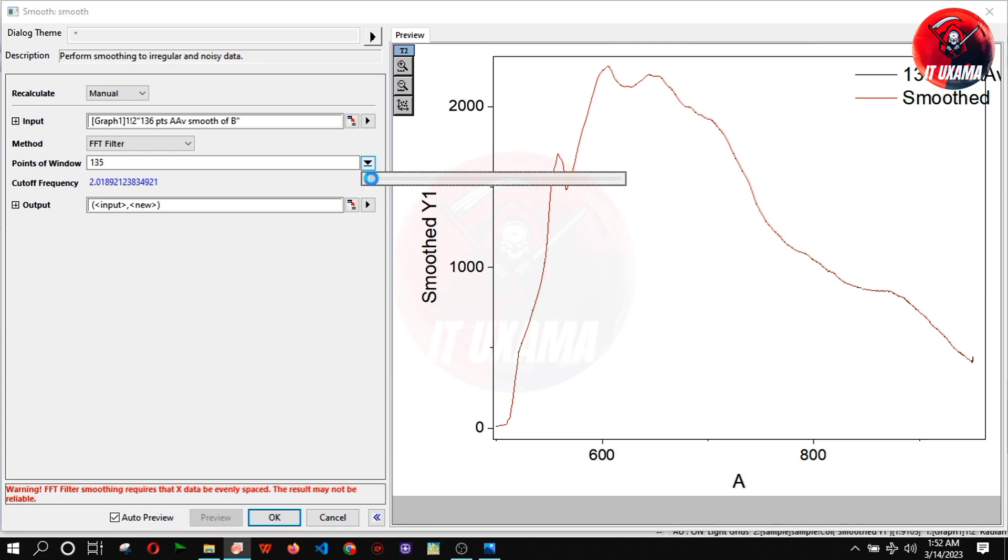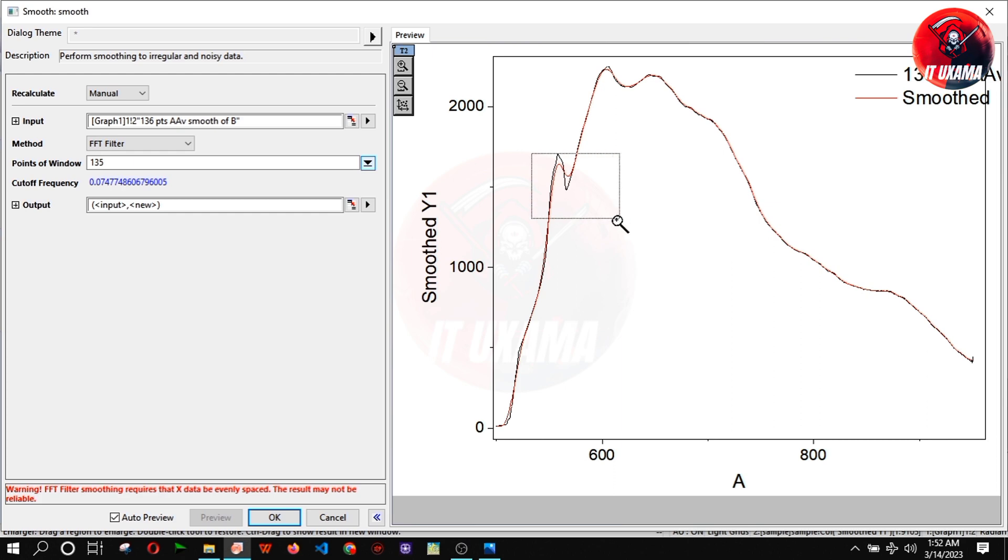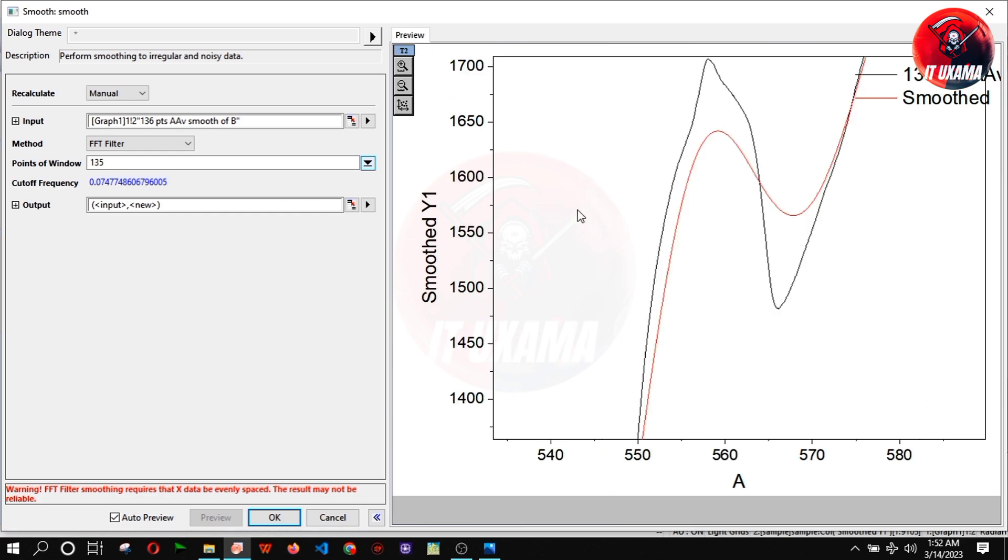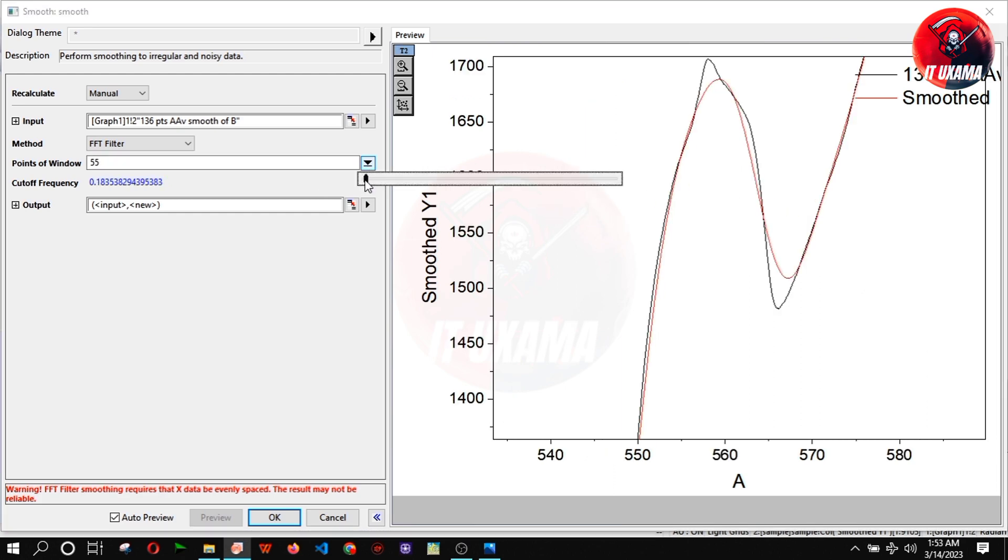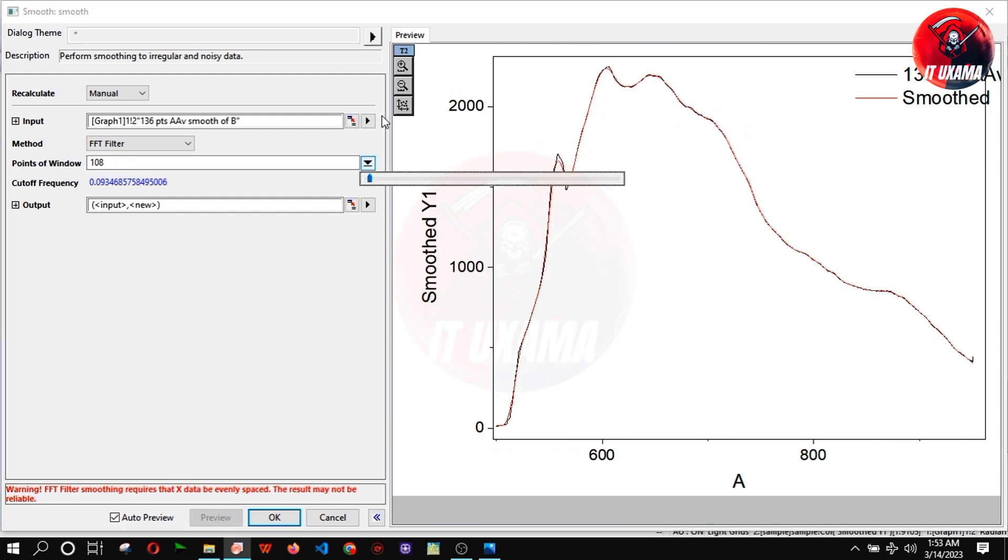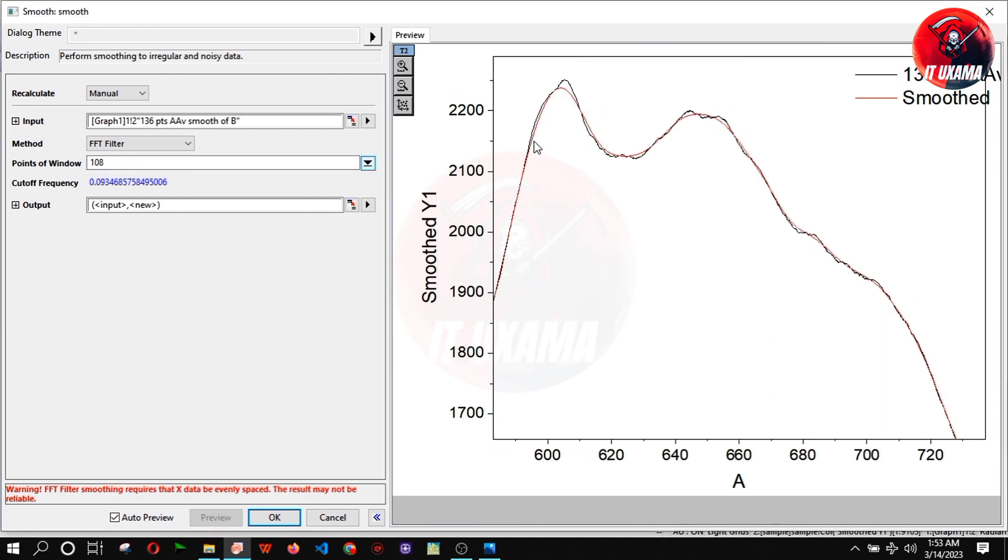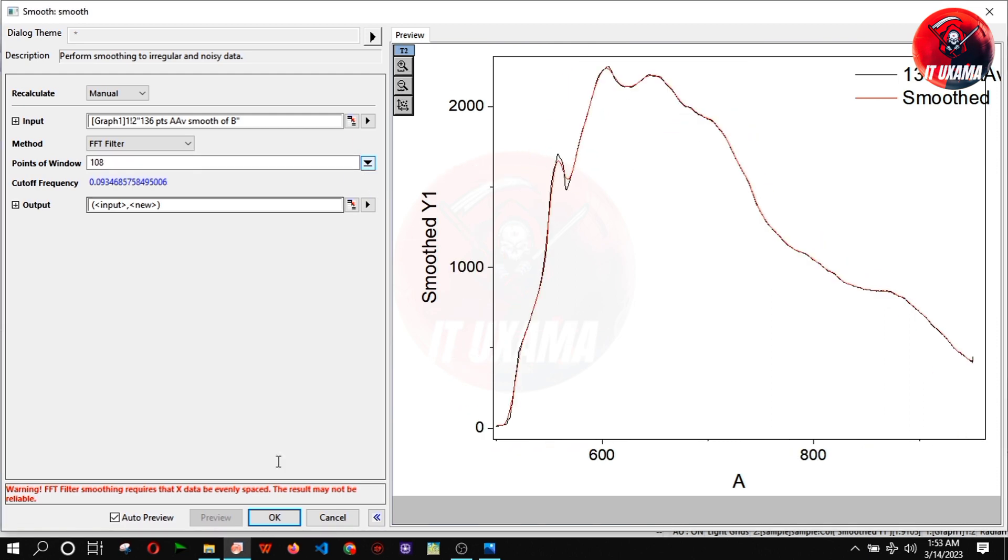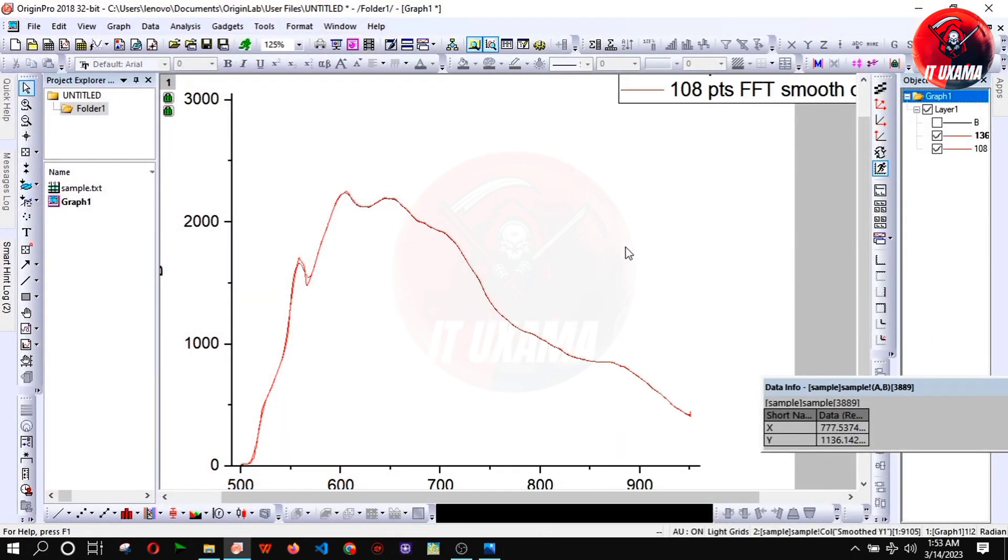Now increase and adjust the number of points until you get a continuous curve. Press ok. Hide old peak.